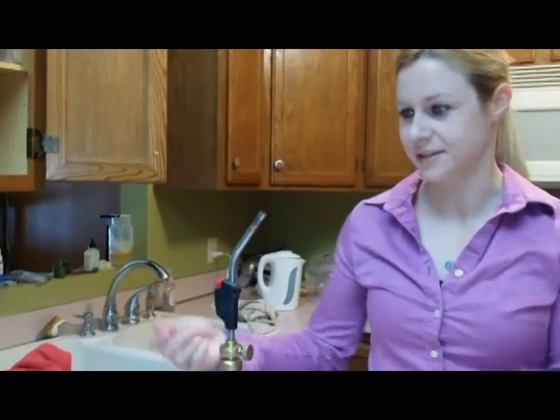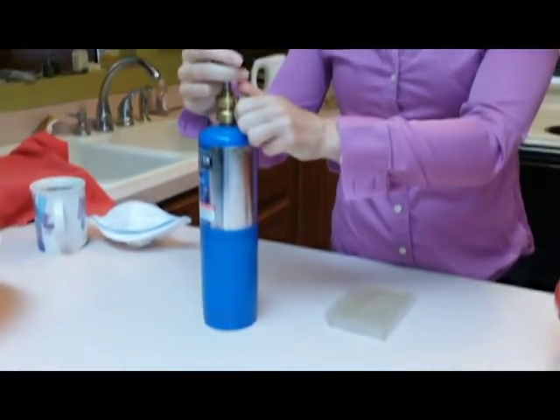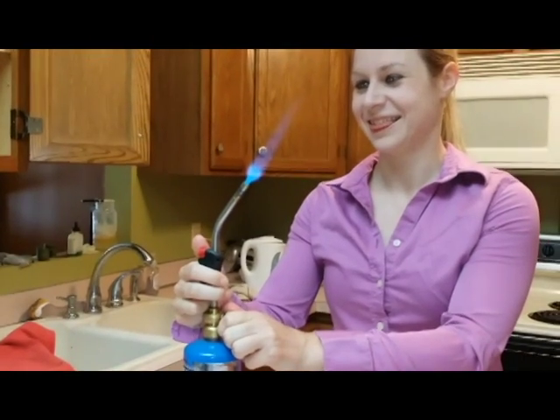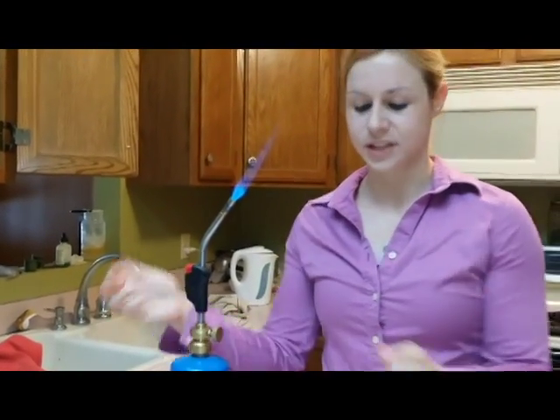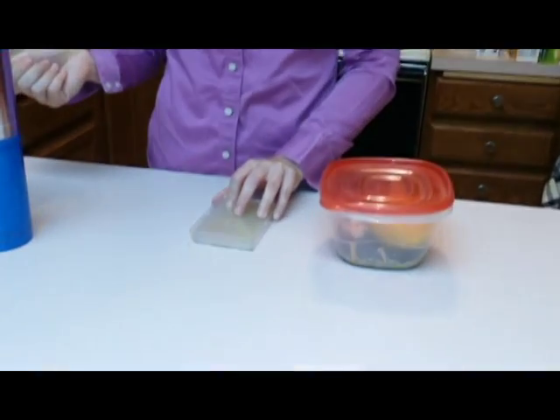You'll need your Bunsen burner, also known as propane torch. You'll need a sterile agar plate. This particular one is potato dextrose agar. And you'll need your culture that you're going to be subculturing.